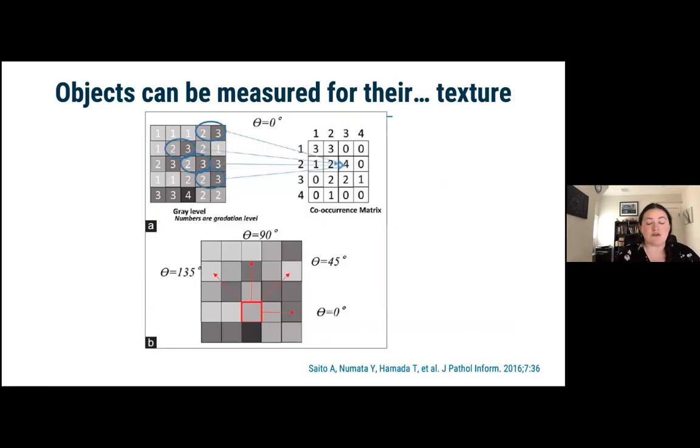And again, returning to the less human intuitable, things like texture measurements, which all have various underlying mathematical definitions that are linked to in the module help, but essentially come into play when I break my image back down into thinking of it as individual pixels with individual values.